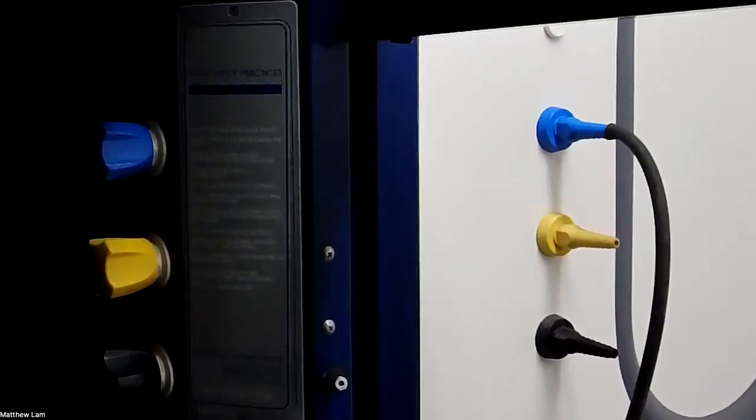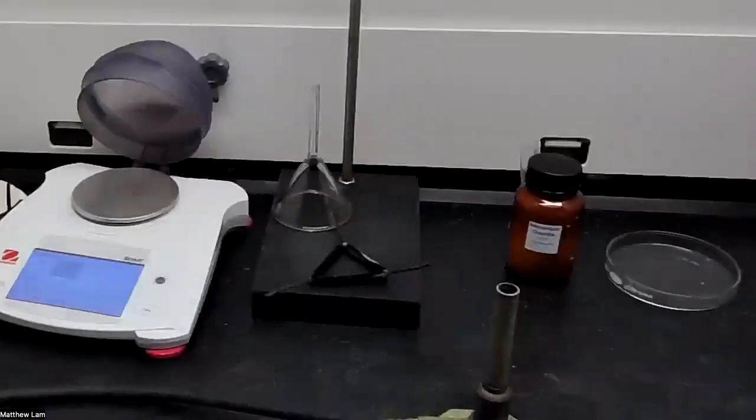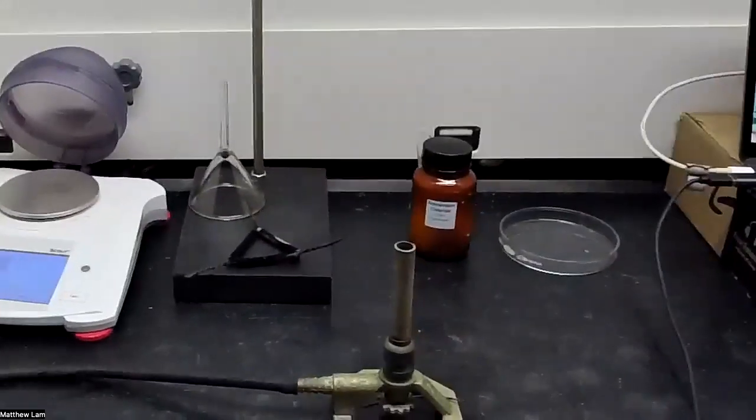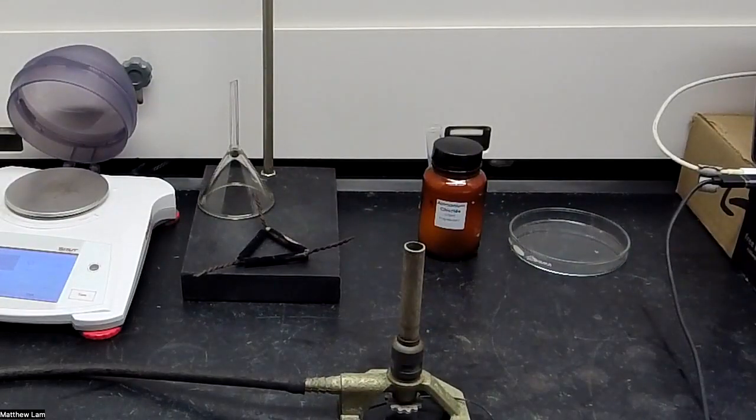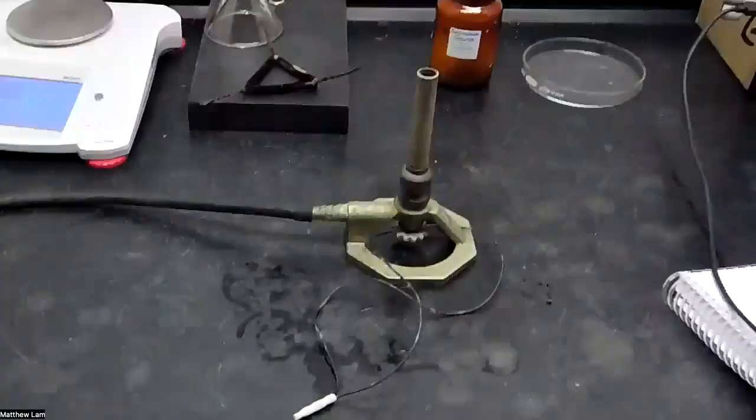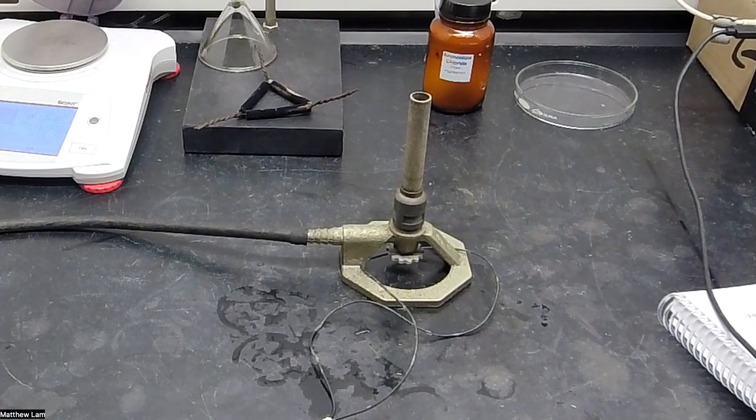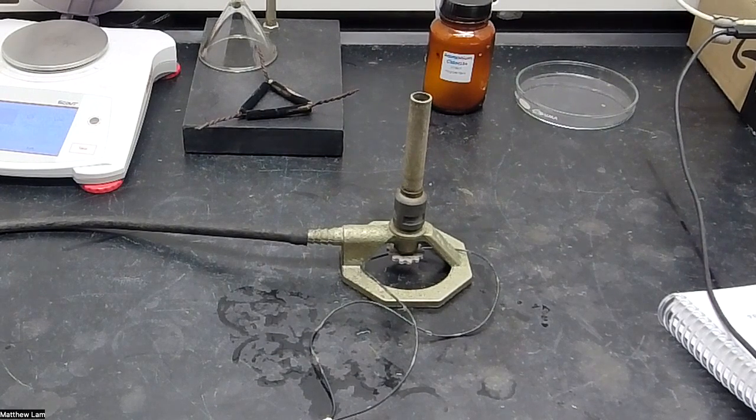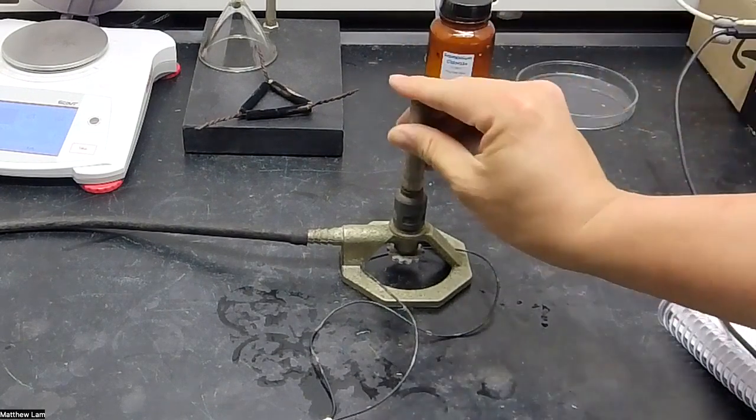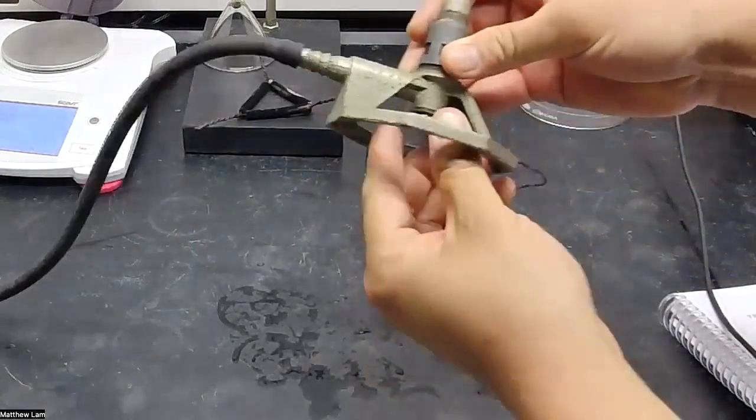The gas line is controlled by that blue knob over there, but you can also control the amount of gas that is put into the Bunsen burner. So if I turn this blue gas knob up here, which you can't see, gas should start coming out.